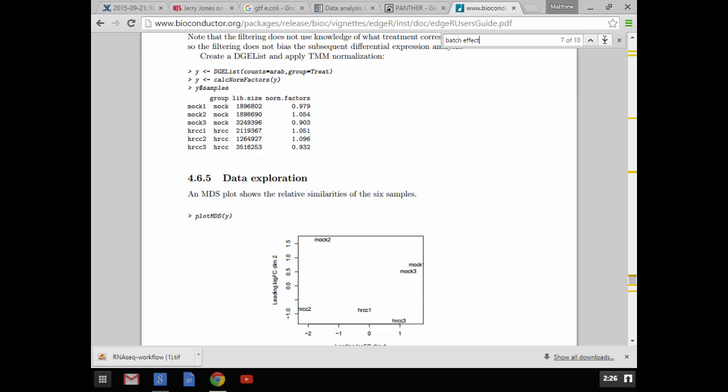You don't want to do it when they actually group together properly, because then you're going to lose all of your sampling power. Does that sort of make sense? It's one of those that you only use when you have to, but if you have to, you absolutely need to apply it.